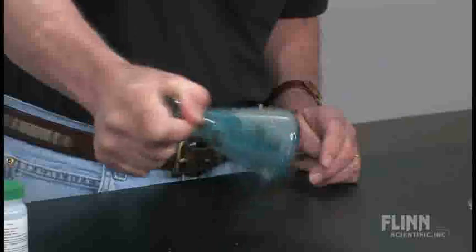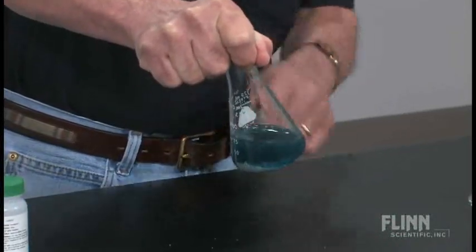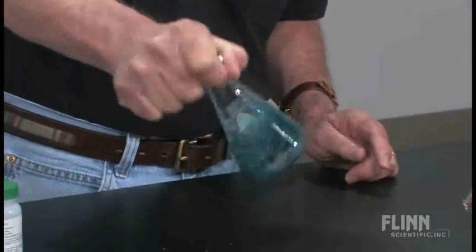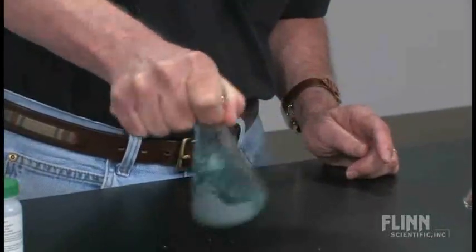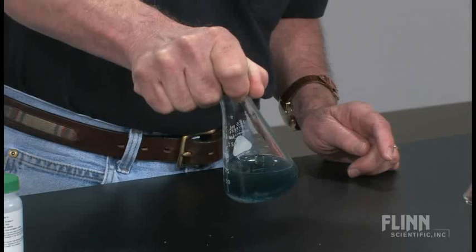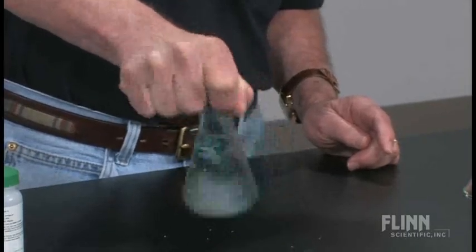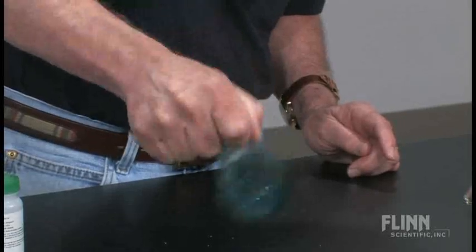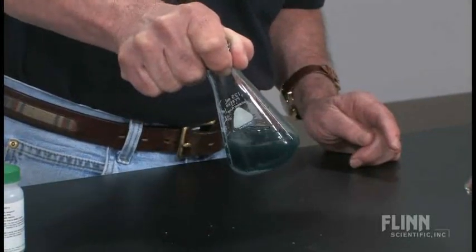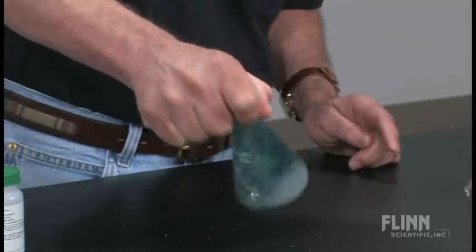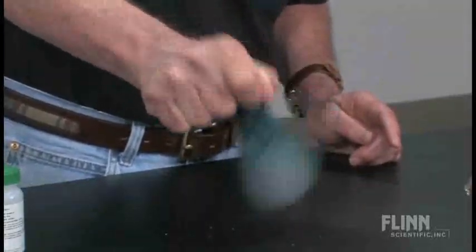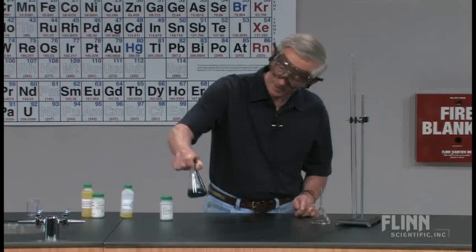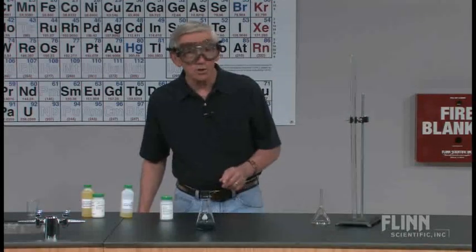This is going to take a minute. What I'm heading for, and you can see I'm starting to get there, is a true purple color. Oh, that's not bad. A little bit more. That's pretty good. That's vanadium 2.